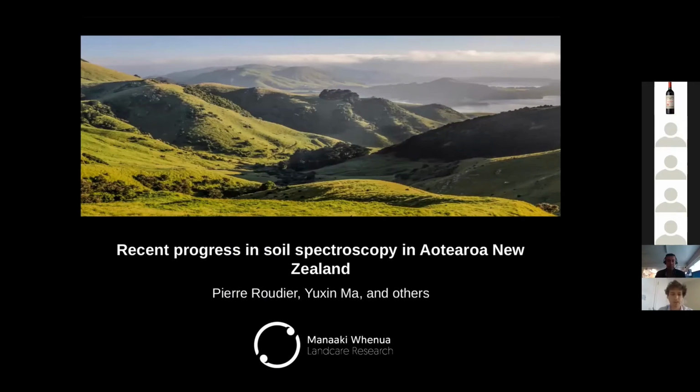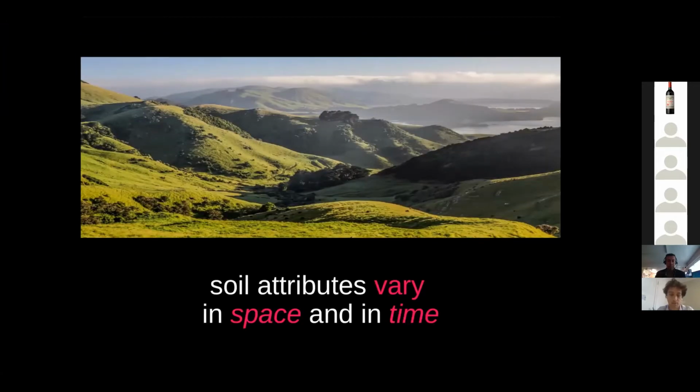So I'm just going to present you some of our recent advances in soil spectroscopy here in Manaaki Whenua. So very much an end user perspective of spectroscopy. Part of our business is to try to understand the distribution of soil properties in space and in time, and that's really the tricky bit of the job when you're interested in soil geography, is that those attributes vary a lot. They vary across space and they vary also across time. And measuring those properties is a challenge.